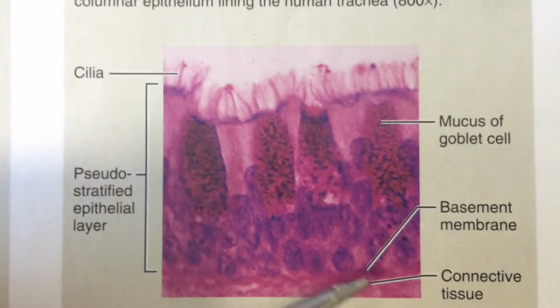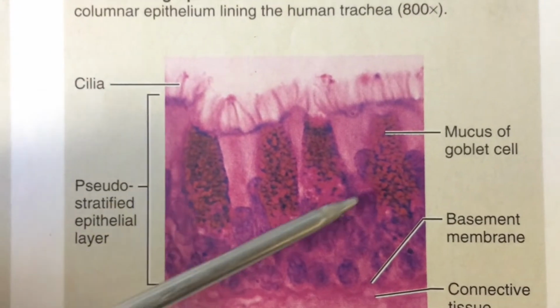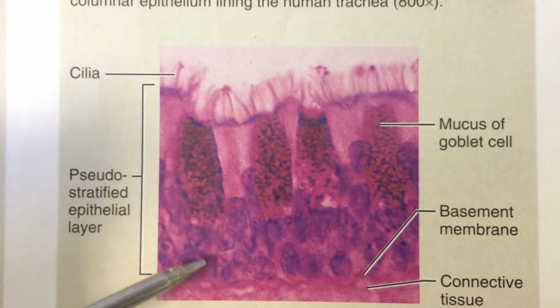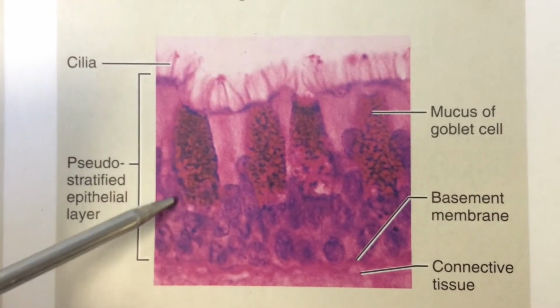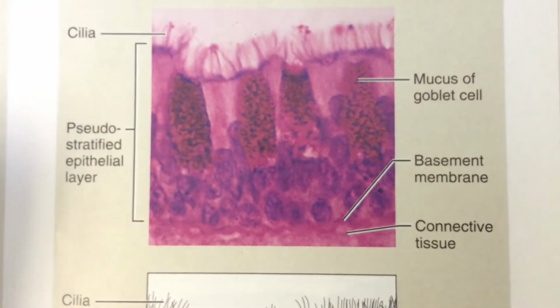The last type is kind of tricky. Pseudostratified, although it is only a simple layer of columnar tissue, looks as if there is more than one layer. To identify this tissue, look for triangles with dark nuclei.